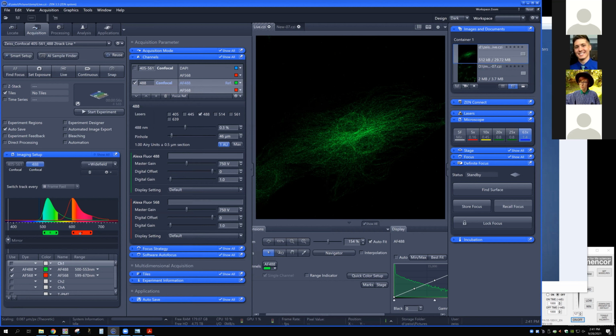So I could, if I wanted to, collect signal from both of these at the same time, but exactly as was just discussed, this isn't usually a good idea, because even though this laser line is much narrower than the emission filters that you were shown earlier, and this excitation is a very select wavelength, if we cross excite, or if this green signal extends into this red range, and if we're not careful enough to avoid that region of overlap, then we're going to run ourselves into trouble, and we are going to see crosstalk.